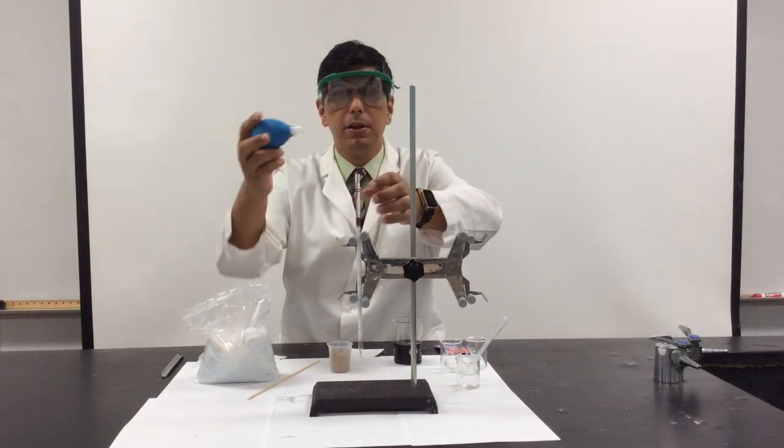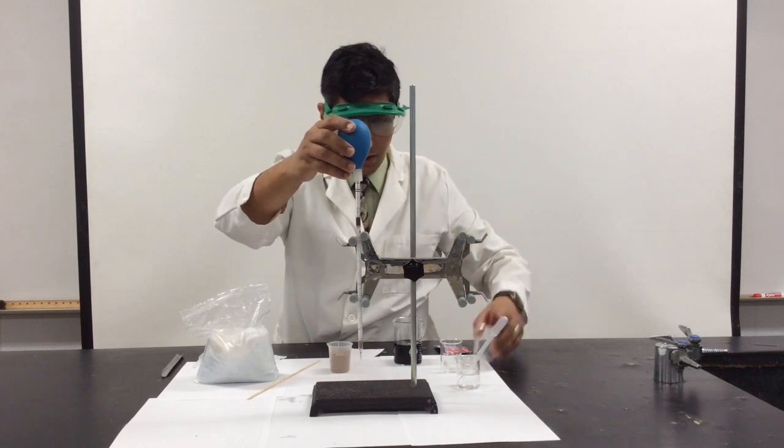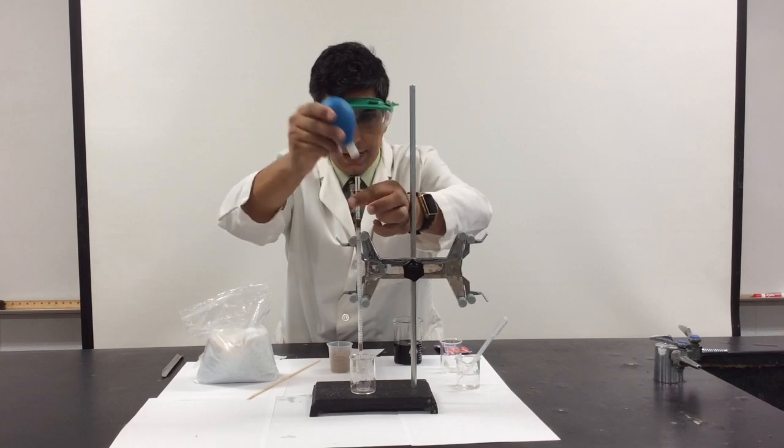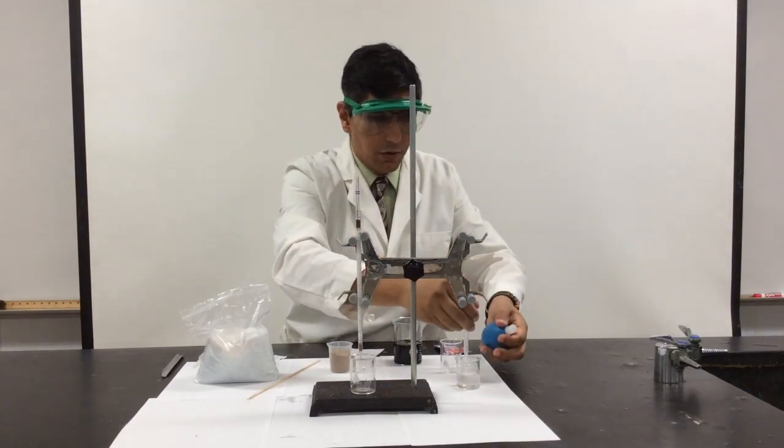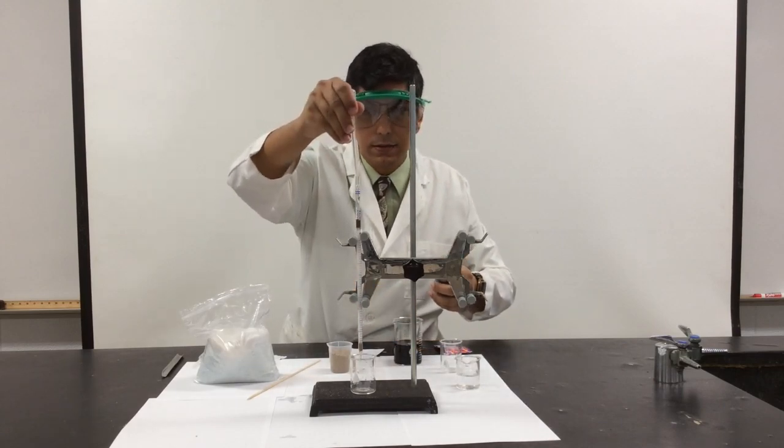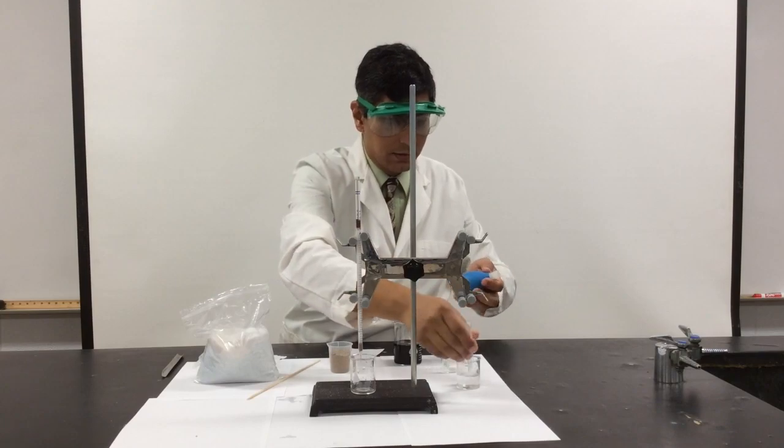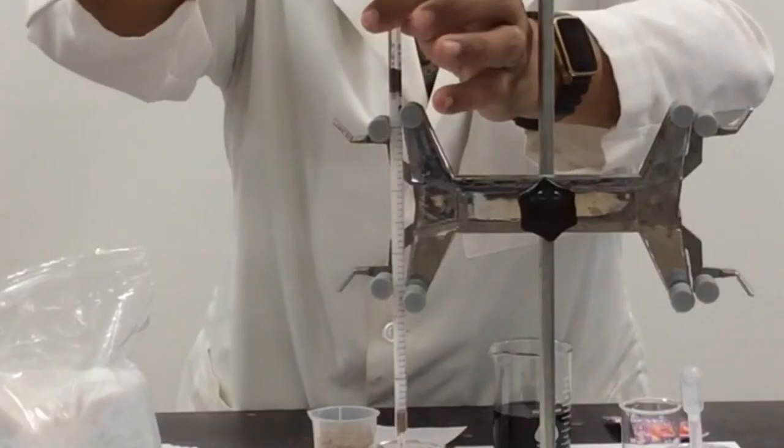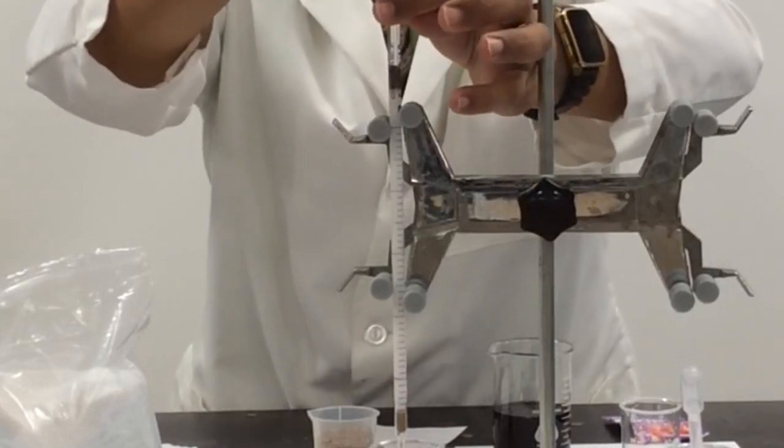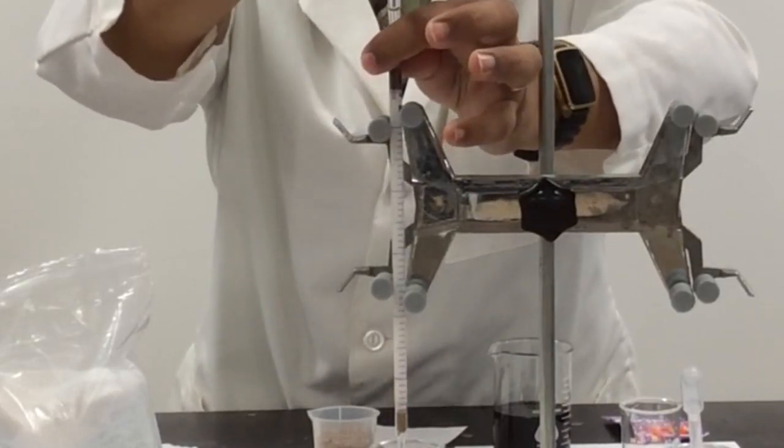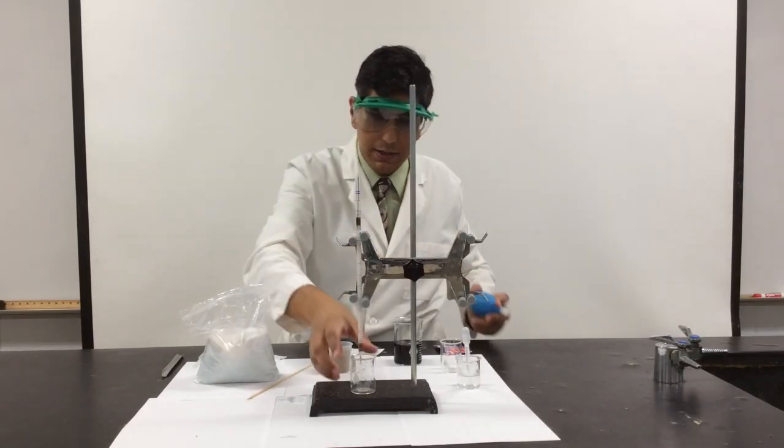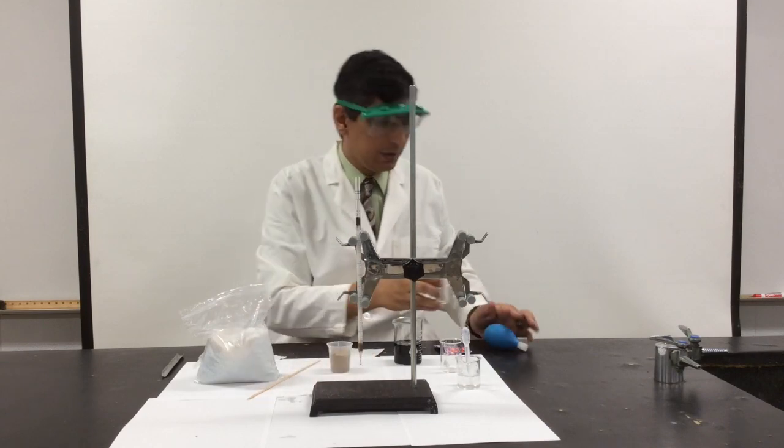So we're going to use this pipette bulb to help things along here. Basically pushing the water through the column to moisten it. And I know that the chromatography column is ready to use when I see a couple drops of water popping out the end of the column. And I see some water here, so that means that the column is ready to use.